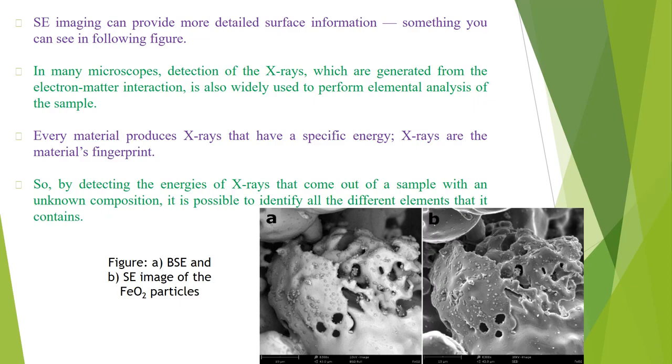X-rays are the material's fingerprints. So by detecting the energies of the X-rays that come out of a sample with an unknown composition, it is possible to identify all the different elements that it contains.